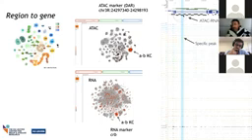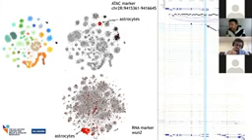And so this means that we can now link this region to this gene, specifically accessible and specifically expressed. And that region could potentially regulate this gene, right? Most of the cases are more complicated, as you can see here, with many-to-many links. This is a region that is specifically accessible in astrocytes, as you can see here, and the nearby gene.